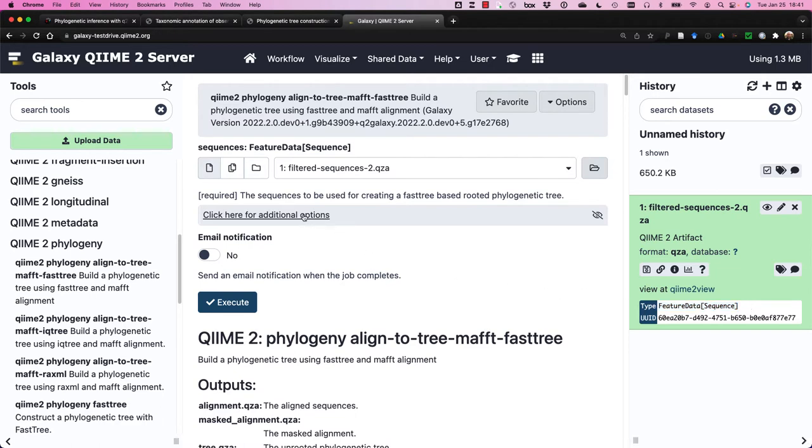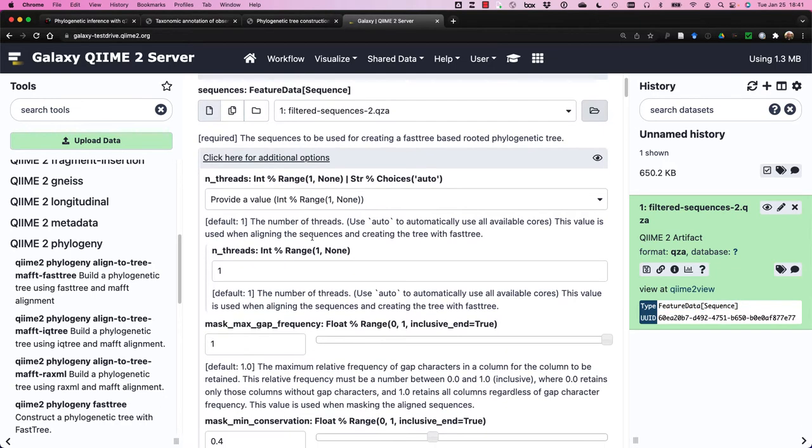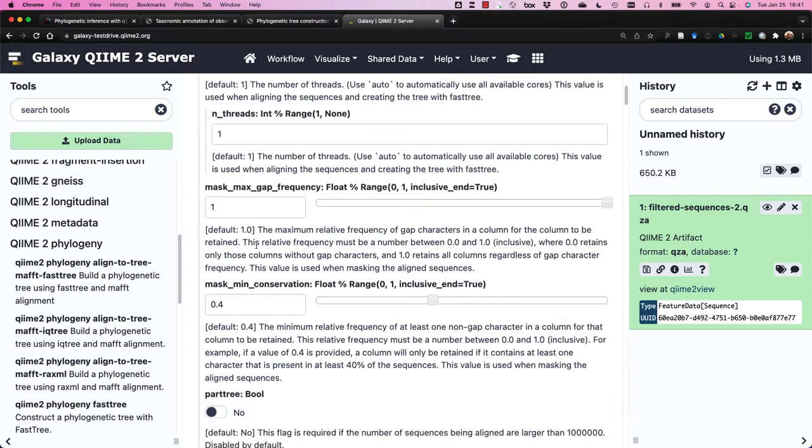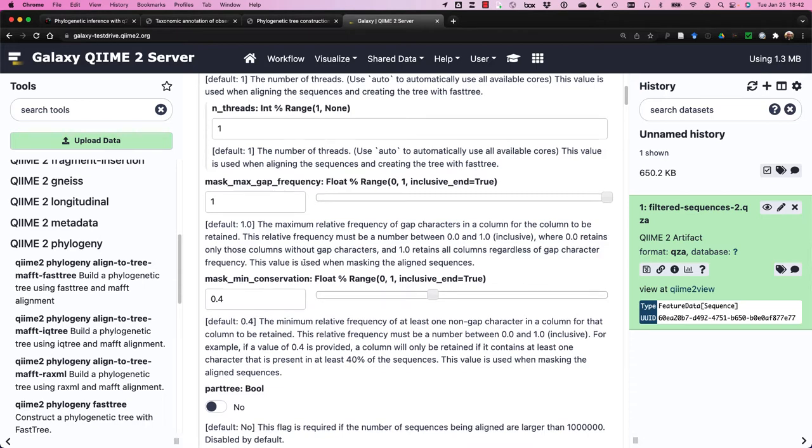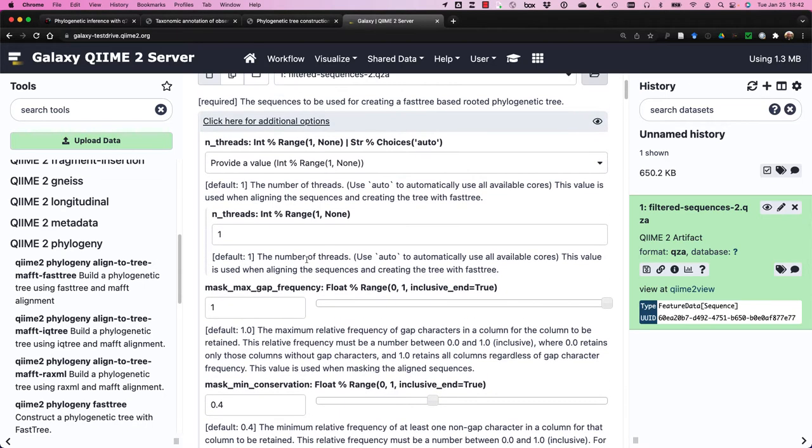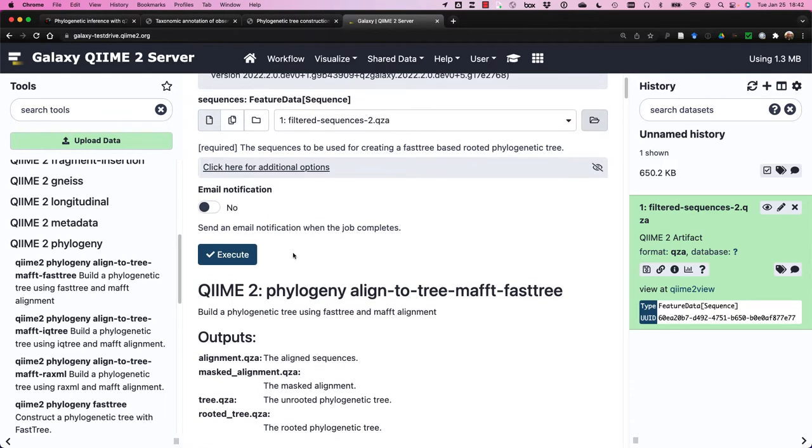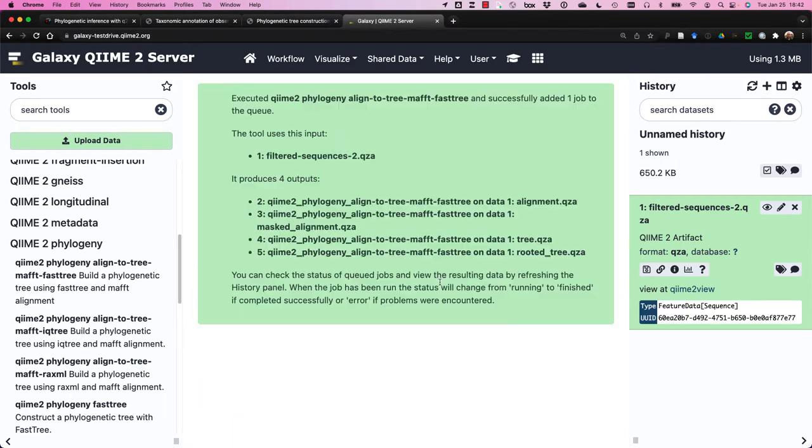There are some options available through this pipeline, we can adjust the number of threads or CPUs that will be used for this pipeline. And we also provide options for how to mask the alignment. Remember one of the steps in this pipeline is after the alignment, it's going to mask the alignment before it builds the tree. We'll leave everything as is, and we'll hide this, and we will execute the pipeline.